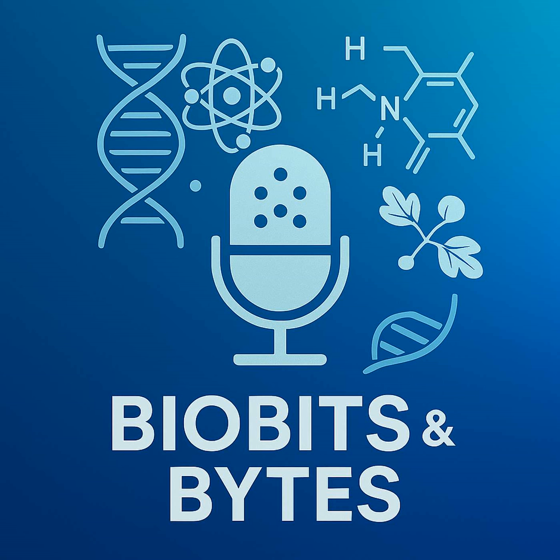Of course, you need the right kit. Those restriction enzymes, the gel setup, buffers, the blotting machine, an oven for hybridization, and crucially, those labeled probes. We've got an image here too showing the gel bands and then the probes lighting up on the membrane. Helps visualize it. Okay, let's move north then. Northern blotting.